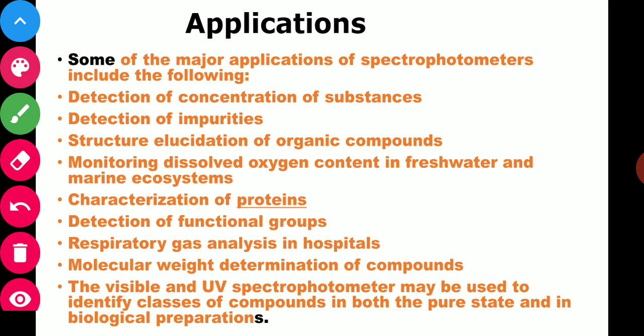The spectrophotometer thus works on Beer's and Lambert's law, that is, absorbance is directly proportional to the concentration and the length of the path, or we can say A is proportional to C and L. So the spectrophotometer is a very important instrument for quantification of some materials, such as phenols, dihydroxy orthophenols and proteins. It determines or quantifies the amount of protein or other compounds in a solution and gives a graph for that, by which we can analyze any standard system for applications in biological systems.